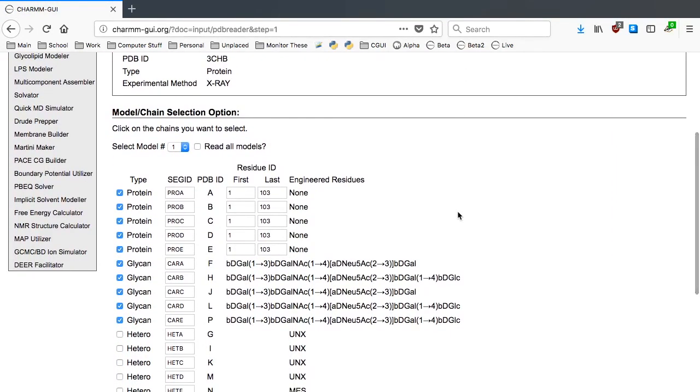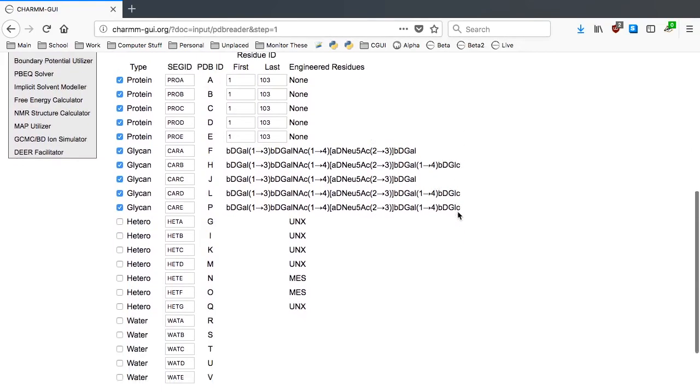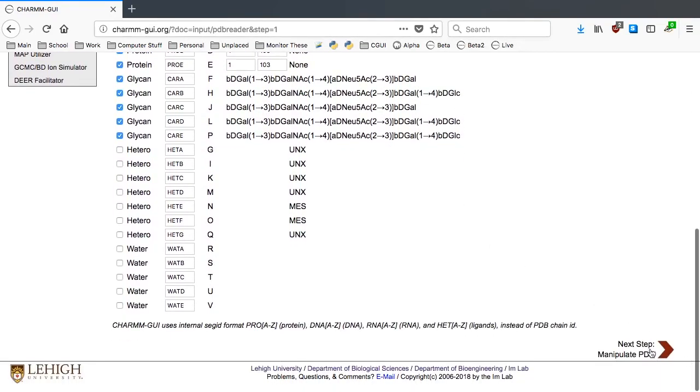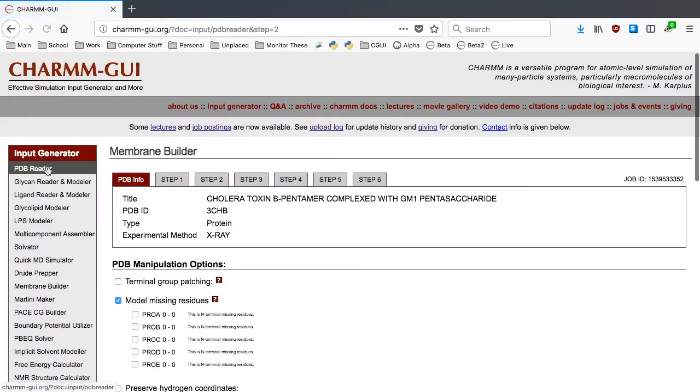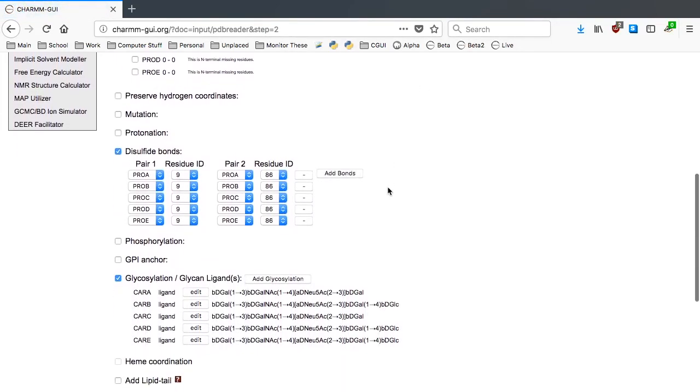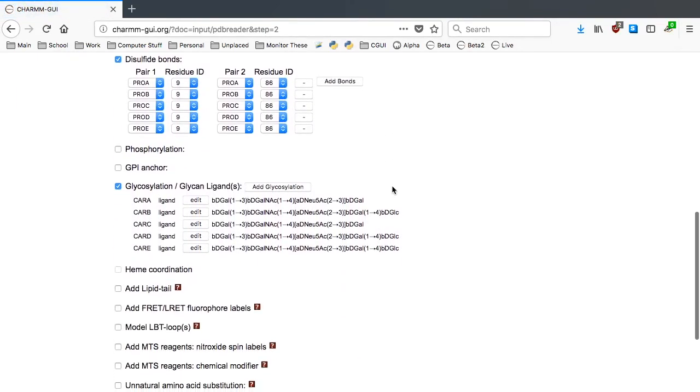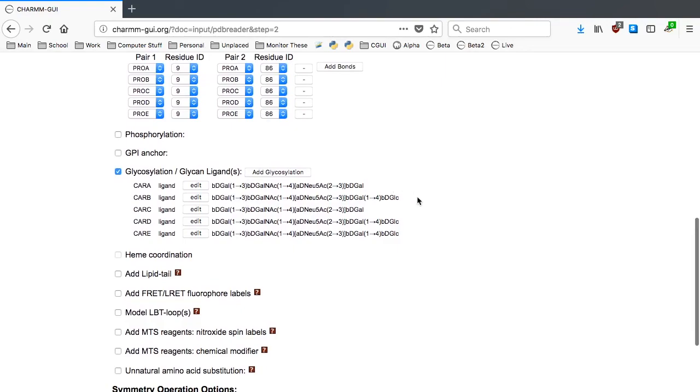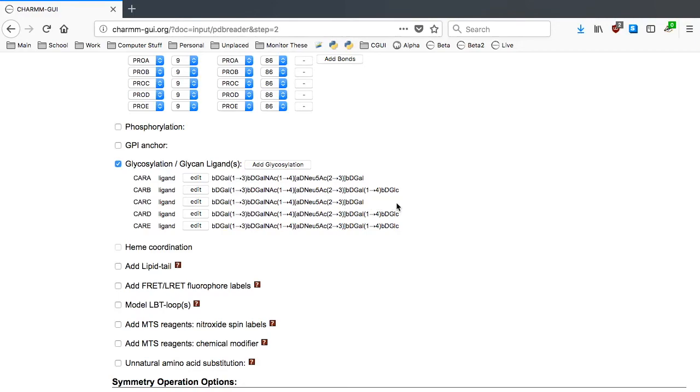Because we have five CTB subunits and associated GM1 carbohydrates in the PDB file, we can go to the next step for PDB manipulation. In this step, we need to focus on the glycosylation glycan-ligand options as we need to add the ceramide tails as well as any missing carbohydrates.